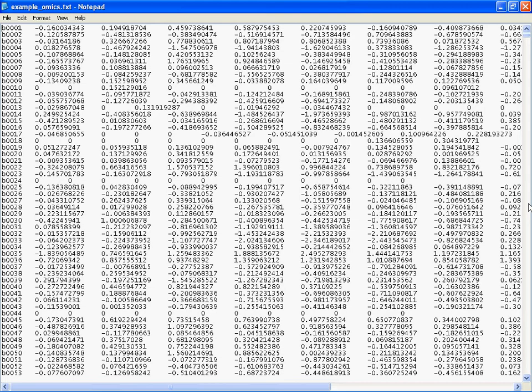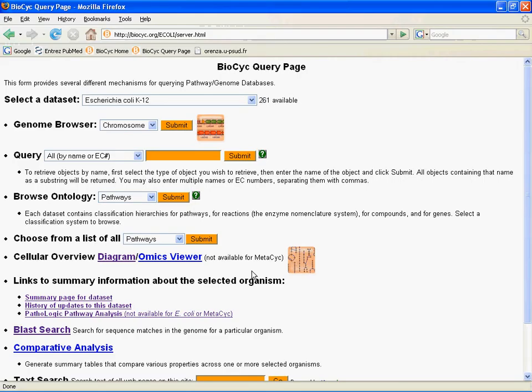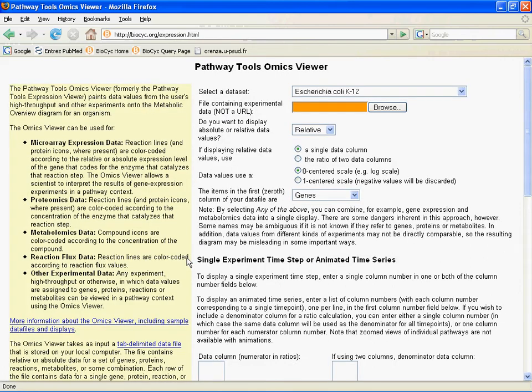So let's go back to the omics viewer now. Here we are at the query page, and I'm just going to click on omics viewer. Note that up at the top, I have E. coli K12 selected. So here we are on the Pathway Tools omics viewer page. You can see at a glance we have a lot of information packed into this page — most of what you need to know to use the omics viewer should be right here, so you can refer back to it if you forget something.